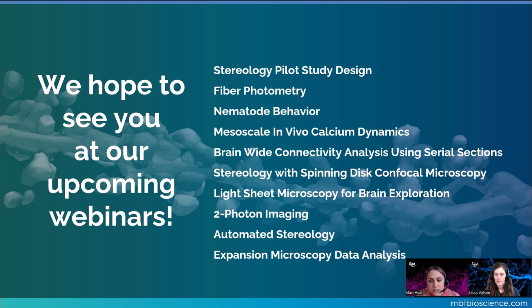You can increase the visual density to resolve to the fullest resolution of the section or the image that you're looking at in the 3D window. But if you need to reduce that computational burden and you don't need the full resolution image to be seen at the highest resolution, it will lower that resolution in memory at a time. Do you have anything to add to that one, Alissa? I don't think so. It can definitely come in handy, especially like we talked about with all this large image data.